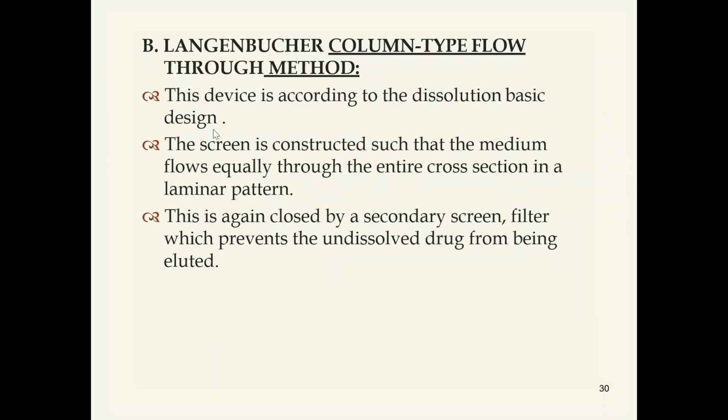So this Langenbucher device is according to the dissolution basic design. The screen is constructed such that medium flows equally through the entire cross section in a laminar flow pattern. Here also the flow is laminar, not turbulent. And this is closed by a secondary screen. Here two screens are there: F1 screen 1, F2 screen 2.